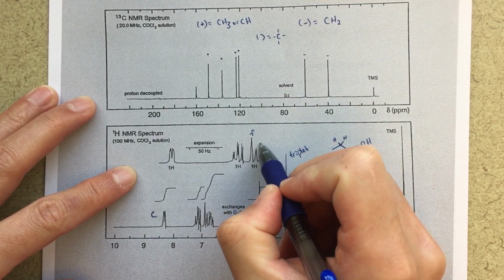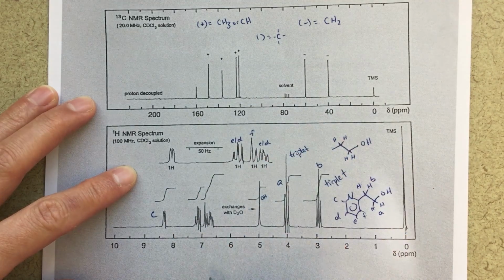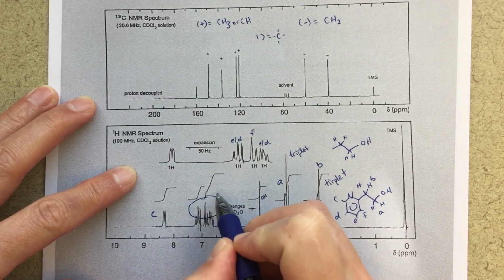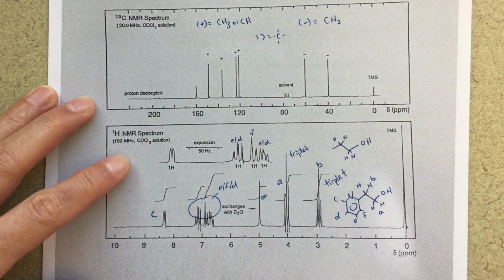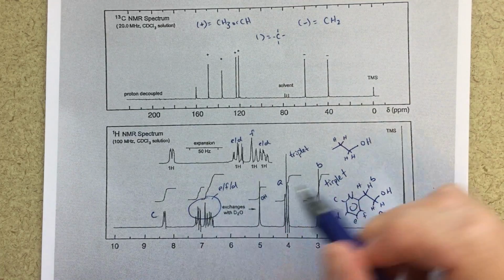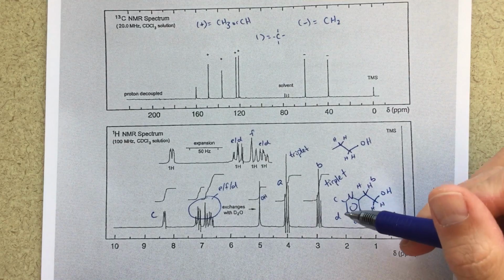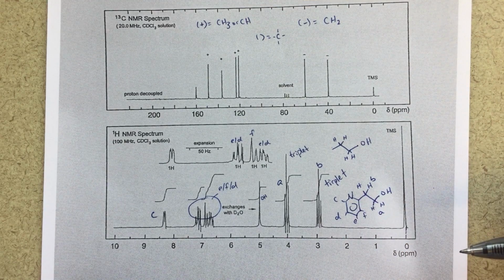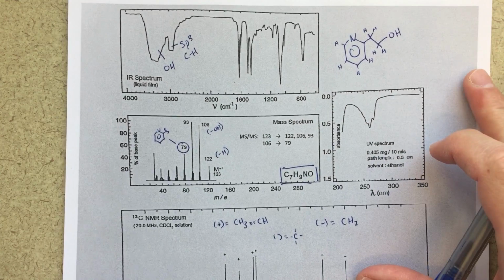So we'll call this E/D, but I think we can just group all of this together as E/F/D, or D/E/F. All of that would be grouped together there, 3 high signal, right, for all 3 of these species here. Yeah, I guess that's it.